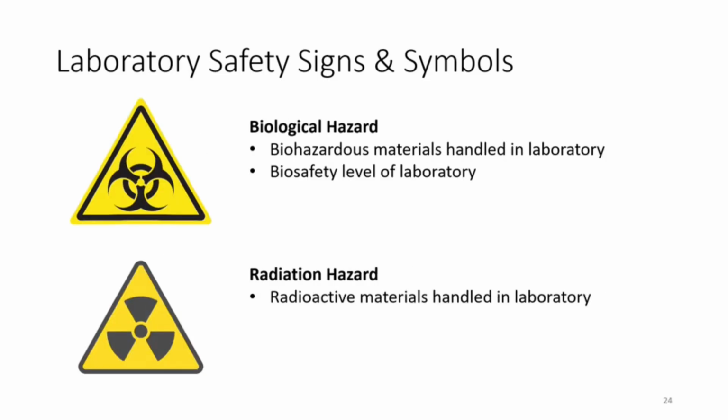Biological hazard. It indicates that there are biohazardous materials handled in the lab. It could also be used to indicate the biosafety level of the lab. Radiation hazard shows that radioactive materials are handled in the lab.